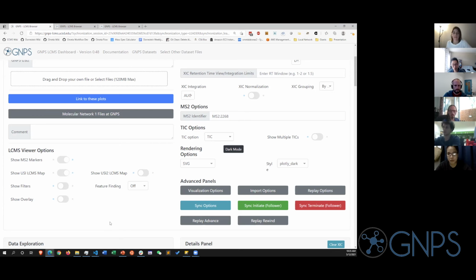You detect one file and you're like, oh, okay, let's do all of our other files, and you're like, no, sorry, that's it. But if that's acceptable in terms of user experience, and you'd be happy to work with us to incorporate the code, we're happy to do it, as long as it's reasonably computationally efficient, because everybody shares the same resource. If it takes like 10 minutes to do feature finding, then it doesn't make any sense.